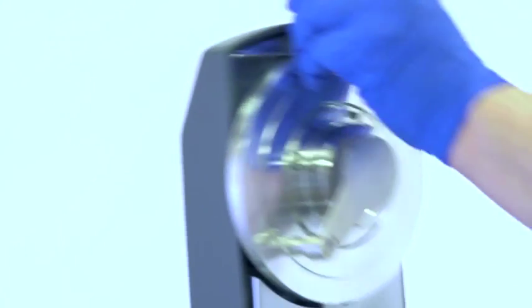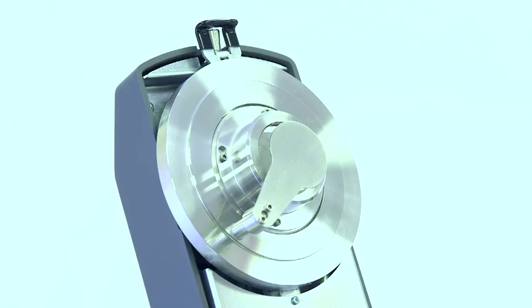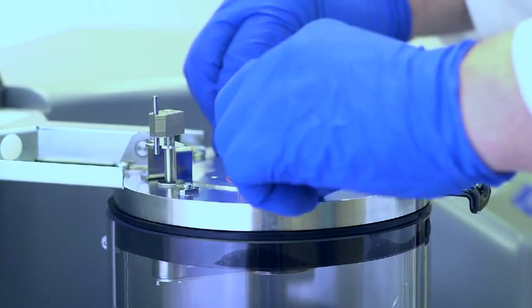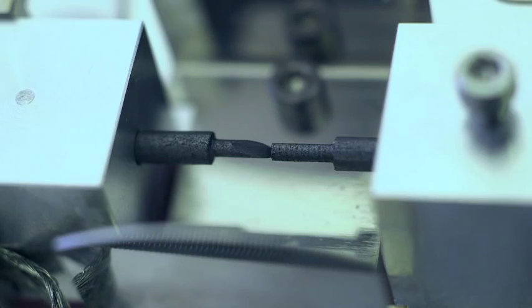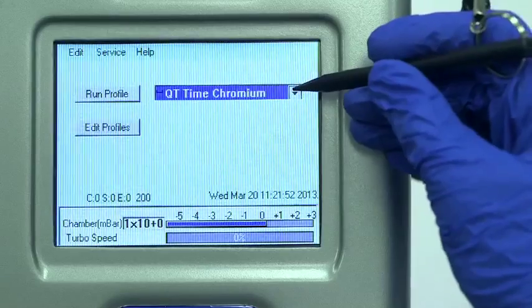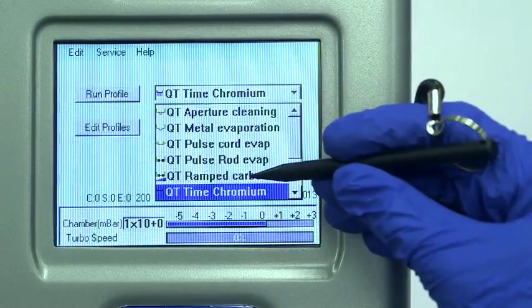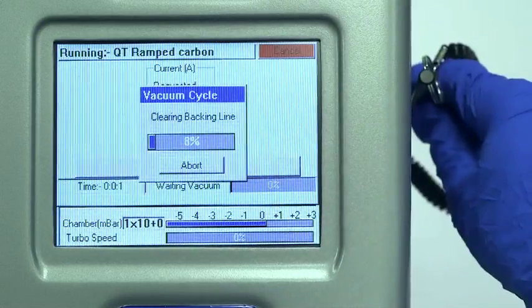The top cover is fitted with an automatic shutter and accepts the easily interchangeable coating inserts, which are recognised by their unique pin configuration. The Q150TES is supplied with a 3mm carbon rod head, rod shaping tools and specific system profiles to meet the requirements of the most demanding TEM and SEM carbon coating techniques.